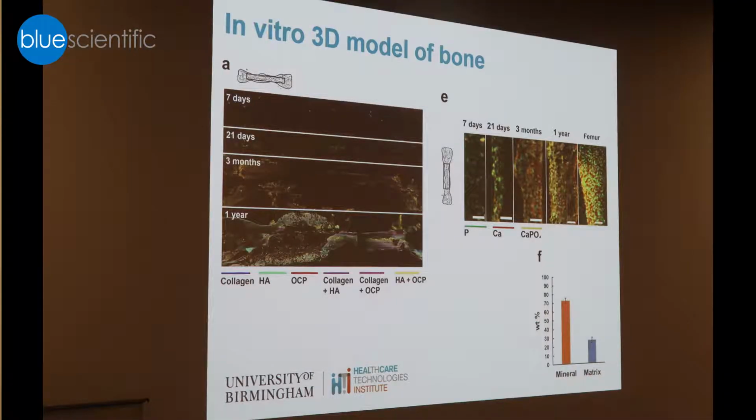What we use from the Raman is, once we can identify where these calcium hotspots are, we can use Raman to probe them in greater detail. And indeed, once we know where the calcium phosphate is, we can find out what phase it is. And this is really important to us because these 3 phases here, octacalcium phosphate, hydroxyapatite, these are early and later markers of bone maturation over time. And here we can visually see how the bone is maturing from this dark red to purple color to the more greeny mature bone over time.